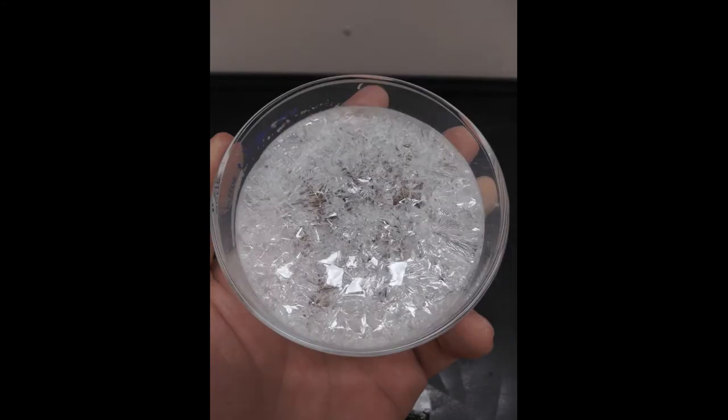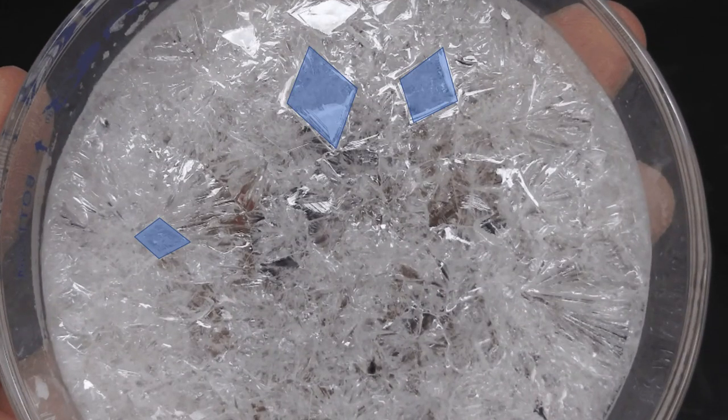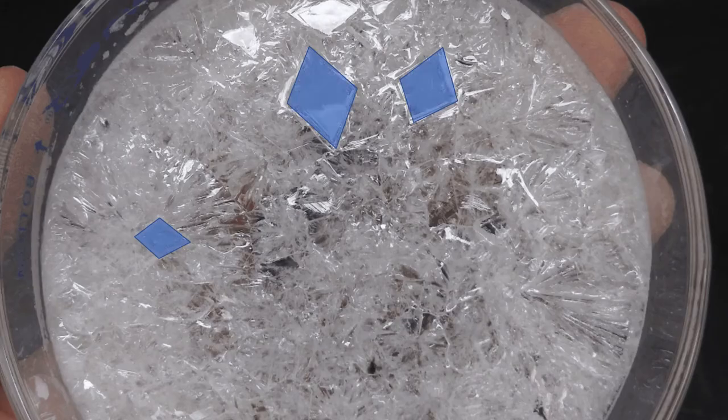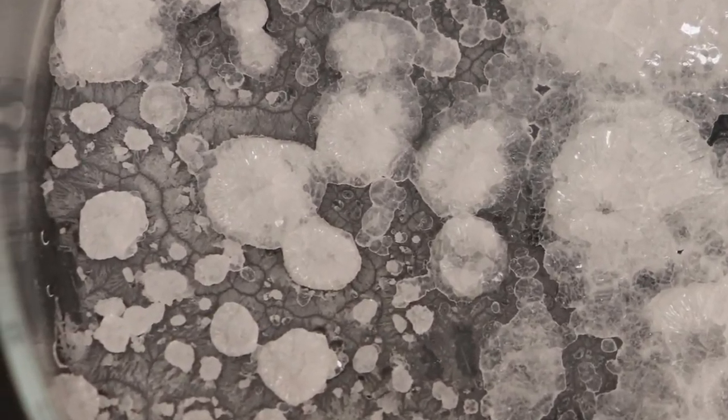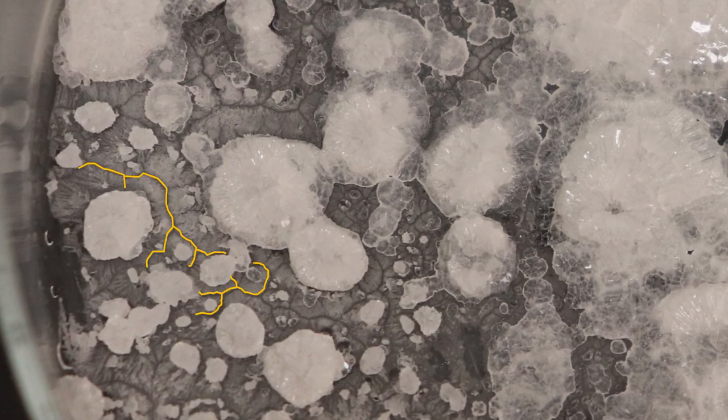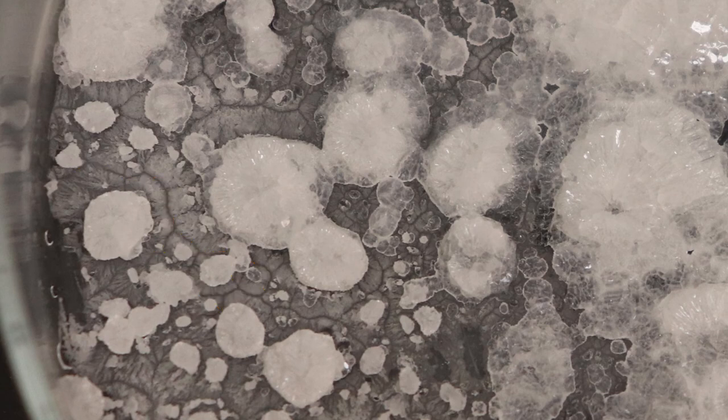Here's an animated gif of the first experiment. And when I highlight a few of them, you should be able to see several more of them throughout the dish. See how nice they look? Okay, one more time, let's zoom in on the fast-growing crystals. You can kind of see a geometric pattern in these zigzag lines, but they're not nearly as well defined as the slow-growing ones, and they're much smaller.